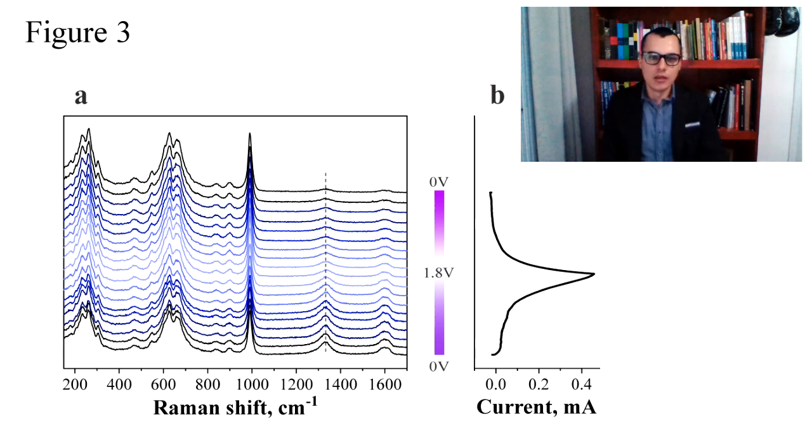As I said, this figure shows the Raman spectra on the left side during dynamic conditions with a voltage window of 1.8 volts, and the central bar shows the voltage variation according to the experiments. And on the right side, the current responses during the Operando study. Firstly, it's worth noting that we did not observe the formation of any new bands regardless of region 1 or region 2. Thereby, there is no production of any extra phase in the charge storage mechanism.